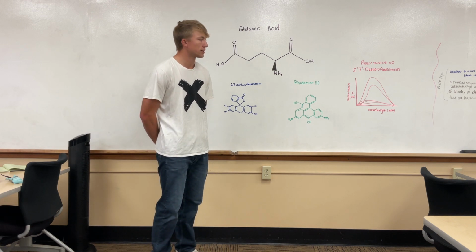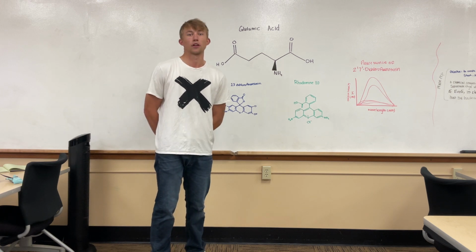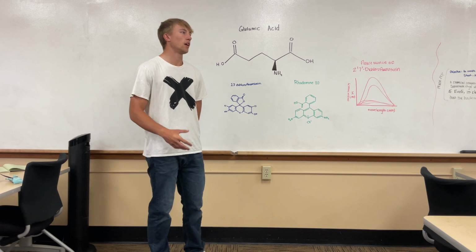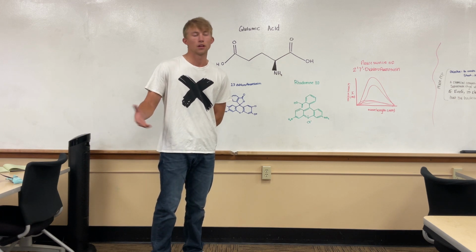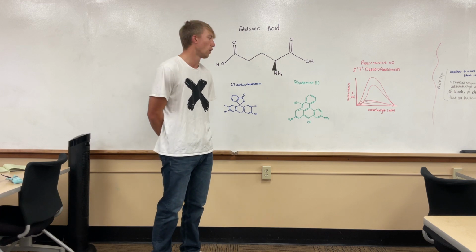We also had really good success with the concentrations and the contents of our cuvettes. We kept the volume of our stock solutions constant in all 6 of our cuvettes, the one exception being the blank with just DI water.